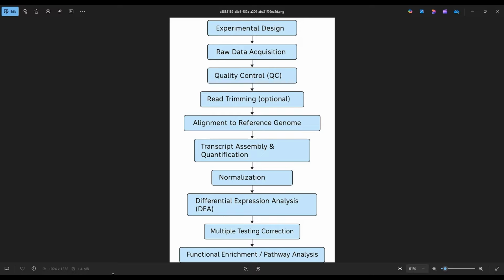On the other hand, biologists actually know that they need the reference genome and they want to do the analysis, but they have a lot of challenges with the tools or the skills, in how they can utilize their skills to get their desired gene expression data and process the whole files. So I've put this summary here, so that first you need to know what actually each step is.